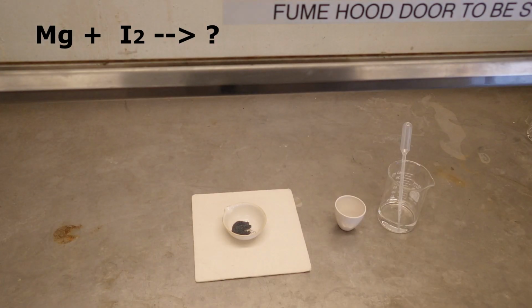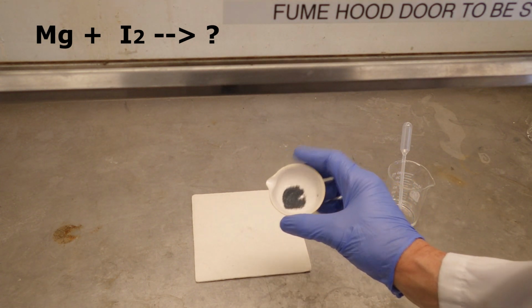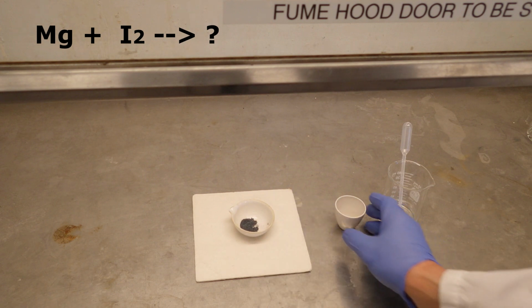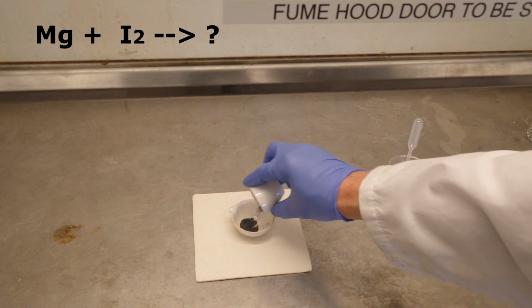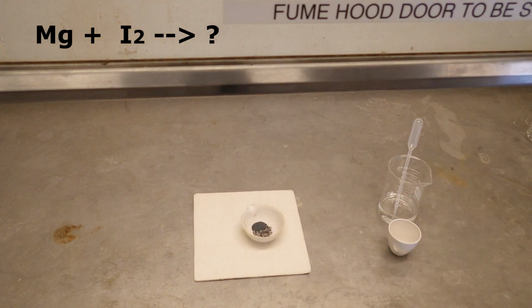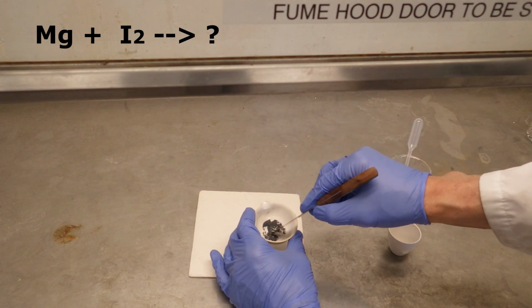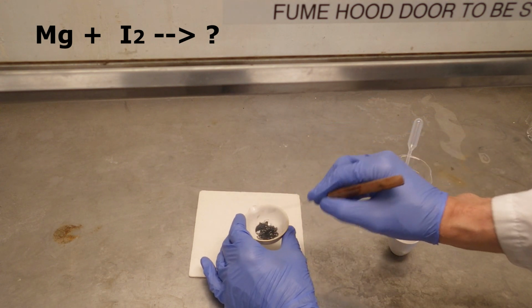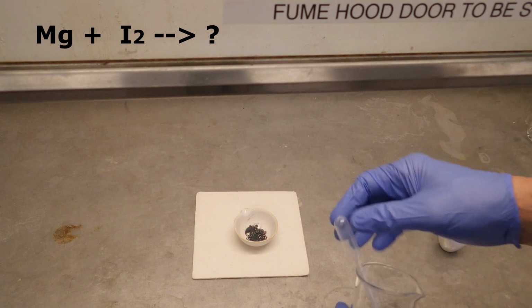Let's take a look at the reaction of a non-metal. This is iodine that I've ground up with a metal. This is magnesium turnings. On first contact, no reaction at room temperature. I'll mix it together and see if that'll get it started. Not looking good. I'll either have to heat this or initiate it somehow. I'm going to try a drop of water first, and if that doesn't work, then we'll heat it.